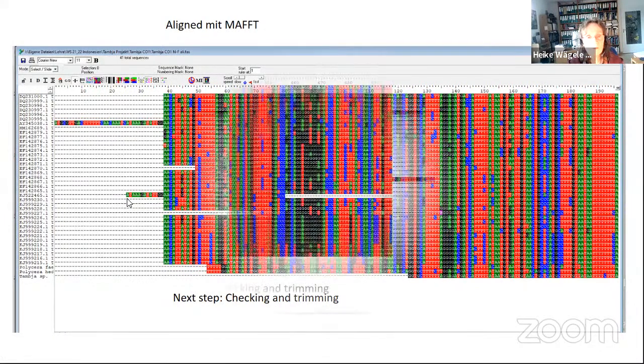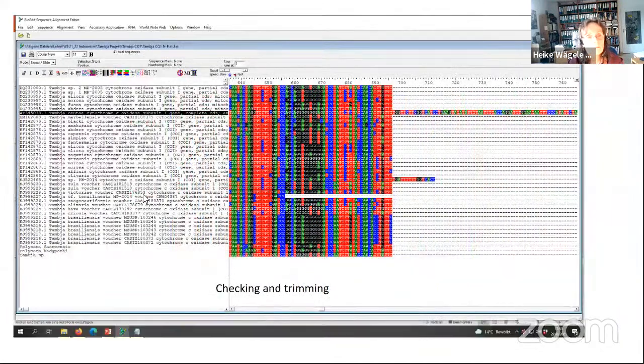If we go back to these CO1 sequences, it's a very long one, 690 base pairs. And again, we have the same one here, extremely long again. So we have to cut this off and also this one because this is no information. But for the rest, that's fine. So we would cut it off actually at 696.